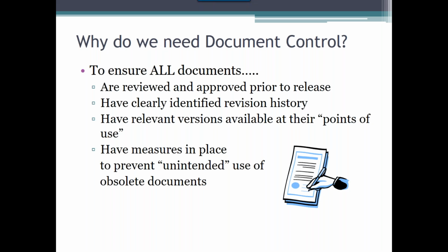Document control processes also assist in the facilitation of securing of appropriate sign-off on all documents prior to implementation. Document control can be performed either via an electronic system or via a manual process. The standard doesn't change whether it's manually or electronically controlled, but obviously the process is far easier with an electronic system.